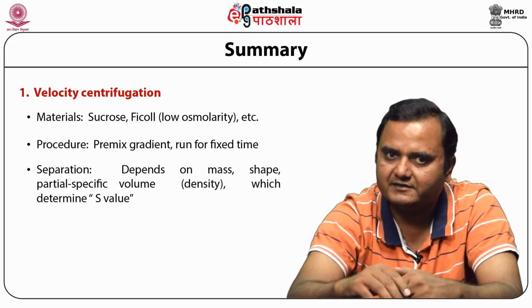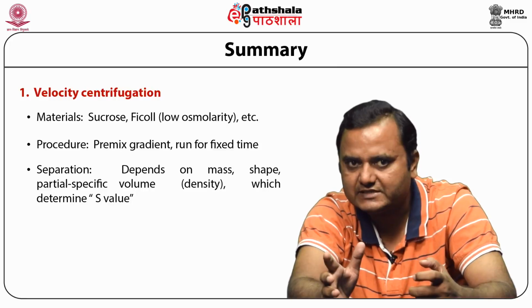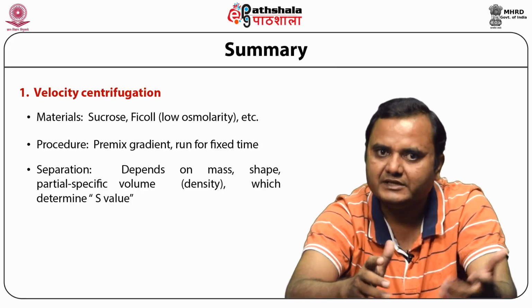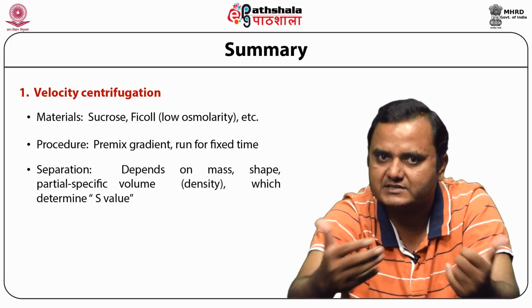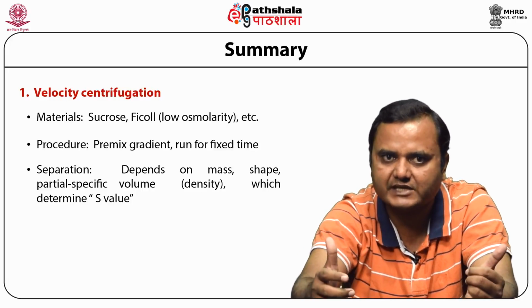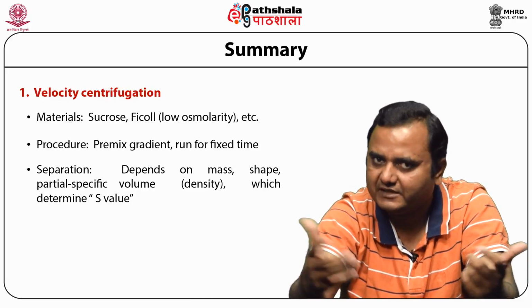So I hope that now you are well aware of differential centrifugation, density gradient centrifugation, their applications, advantages, disadvantages, the different types of medium, the choice of medium, and the criteria for the selection of medium. These things should be very clear to all of you.